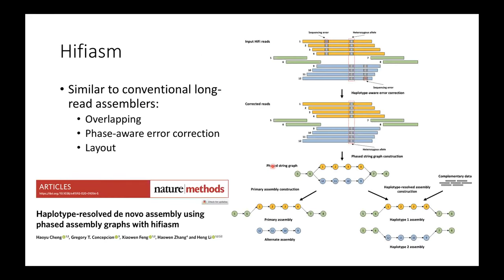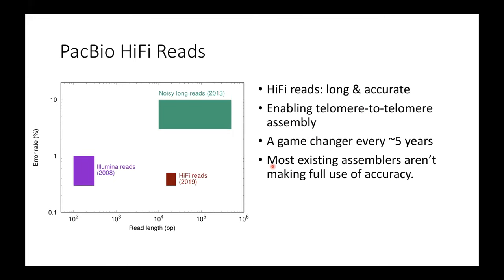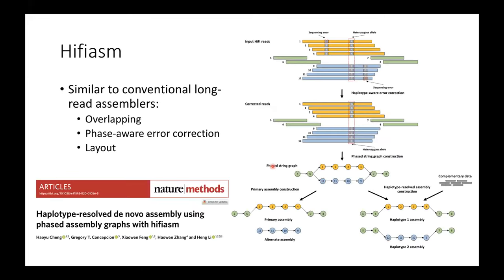And so at that time, when we started to think about this problem, there were no HiFi-specific assemblers. That's why we developed hifiasm. It was published in Nature Methods earlier this year.